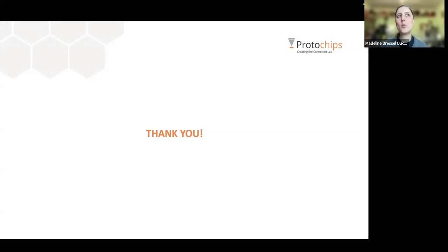Yeah, so one of the things that I know you could try is to use a different type of pump. I know that some of the pressure type pumps, which work just fine with our system as well, will allow you to push and pull a little bit. There's a paper from Stefan Merkens, and I'd be happy to send that to you, that looks a little bit at trying to mitigate the pressure for flow. So that would be one way that you could start.